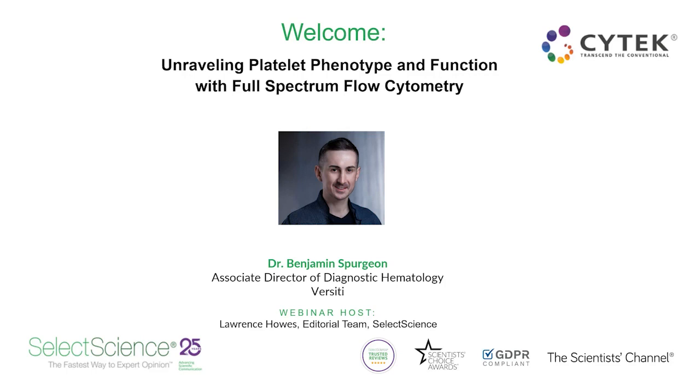This webinar will discuss the advantages of full spectrum flow cytometry over standard tests of platelet phenotype and function, and how it can enable a sensitive and simultaneous detection of multiple platelet biomarkers. Following the presentation, we'll have time for a question and answer session.